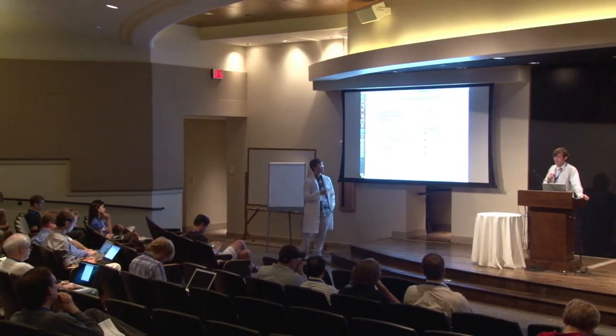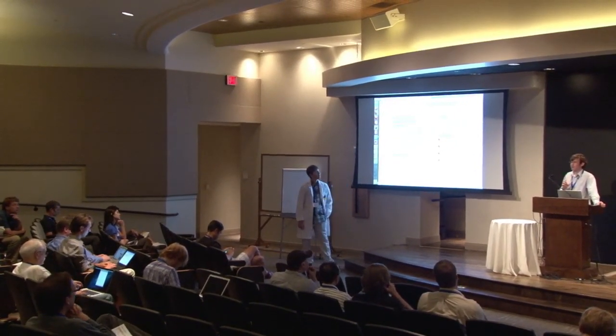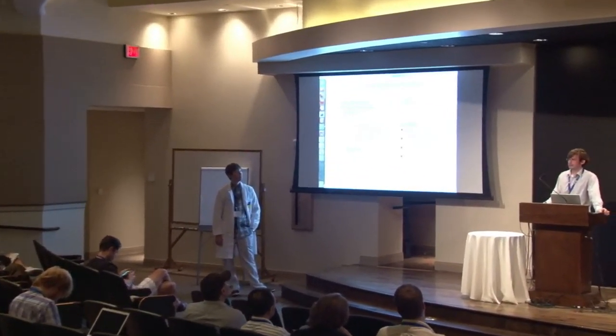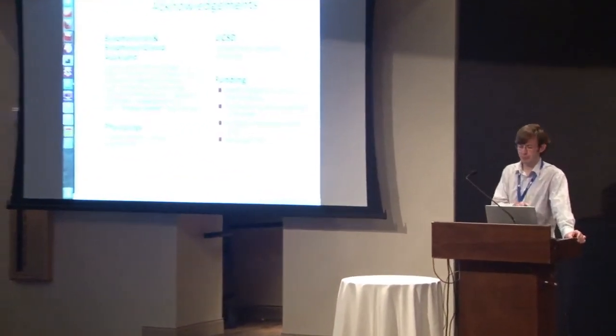Do I have a list of microscope hardware which is supported? The answer is that I do, but it's partial. There's a partial list up on the Google Code site. The short answer is that it's a few cameras, some Sensicam cameras, most PI piezos and translation stages, and there's a few other bits in there as well. If there's enough demand, I'd like to add support for the Micromanager C API.